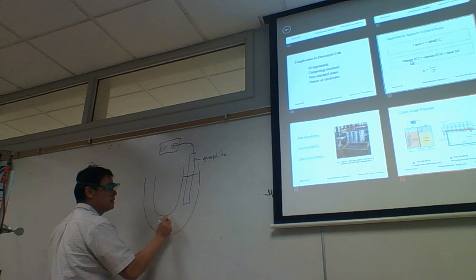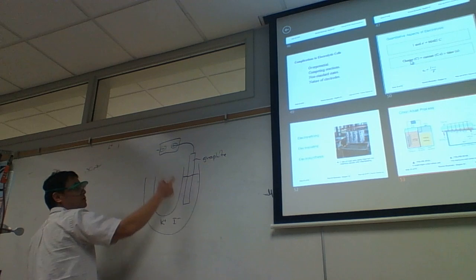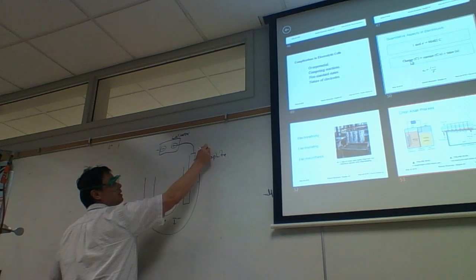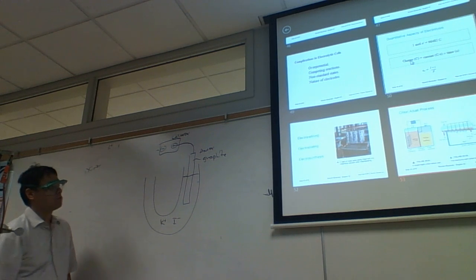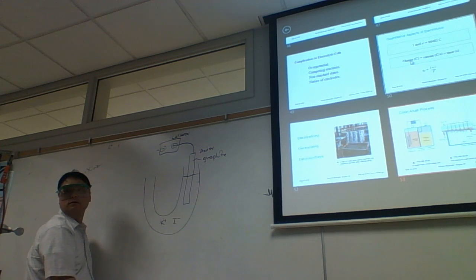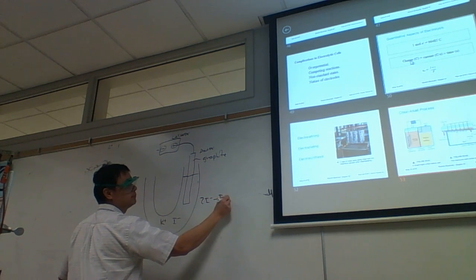We have potassium ions in here and iodide ions, and one drop of phenolphthalein, not much. And so what's going to be oxidized here? This is the cathode of the power supply. And now this is going to be the anode, because the anode is where oxidation occurs. And so over here, am I going to oxidize the potassium ions or the iodide ions? The iodide. I'm going to oxidize the iodide. 2 iodides will form iodine plus 2 electrons.